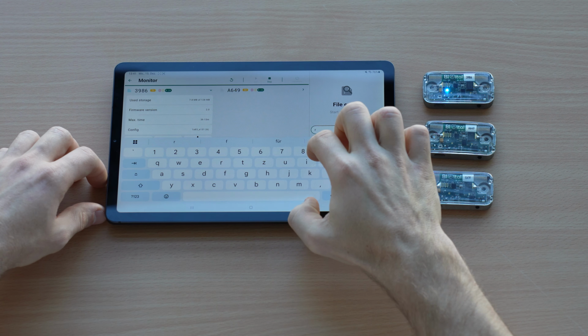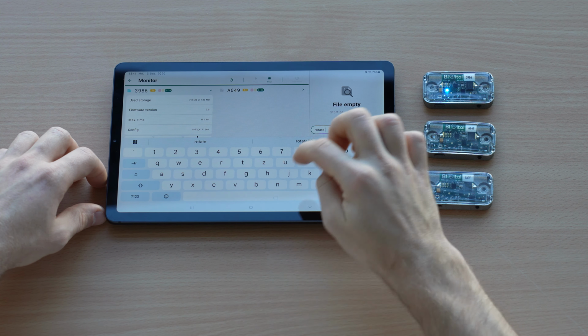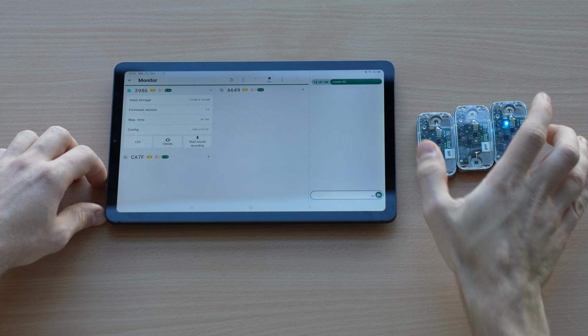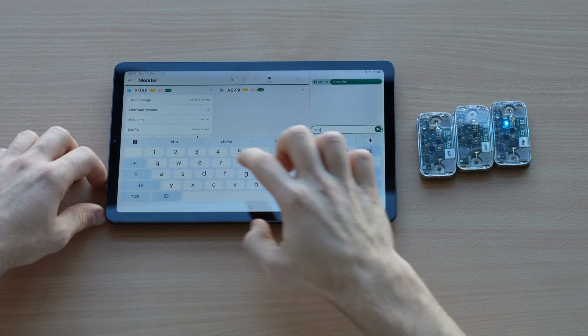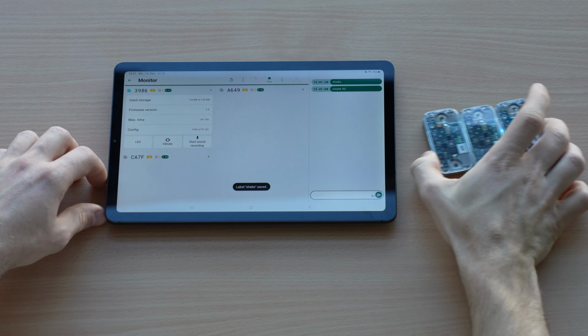After recording has started, the devices can move away from the mobile device. A continuous Bluetooth connection is not required. During recording, you can create labels in the app. These labels can later be exported and time synchronized with the data using the ByVital Python library. Here is an example of creating labels as shown in the video.